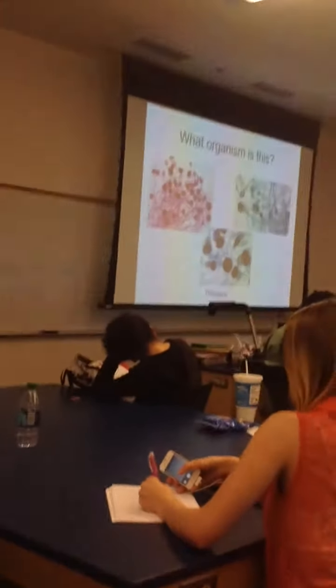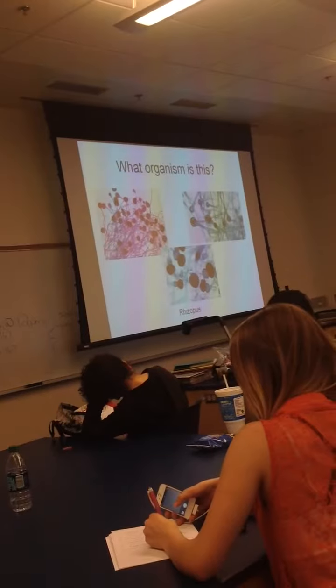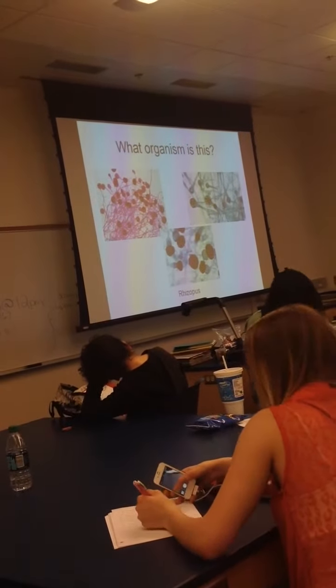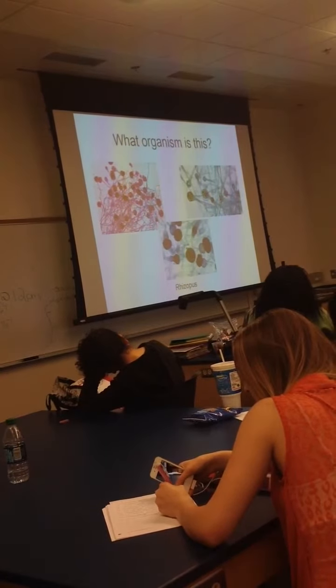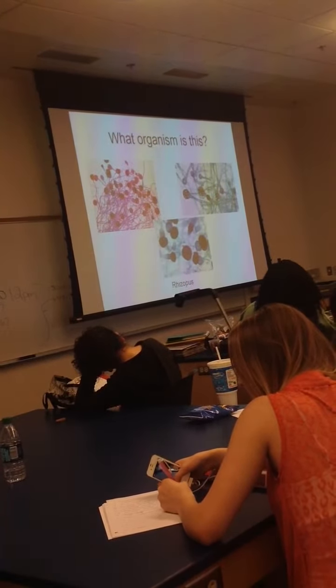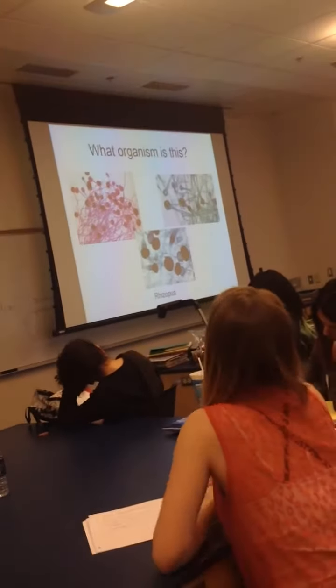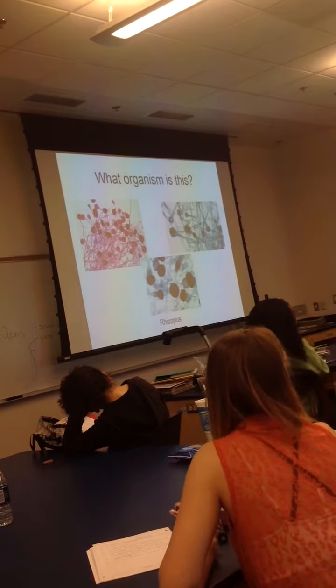How did you know it was Rhizopus? Not the spores. Sporangia. These little balls. Okay? Those are the sporangia. So it's Rhizopus. You have to know the name is Rhizopus. That's what we called it in lab, but it is the black bread mold.